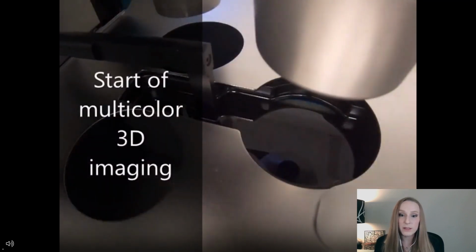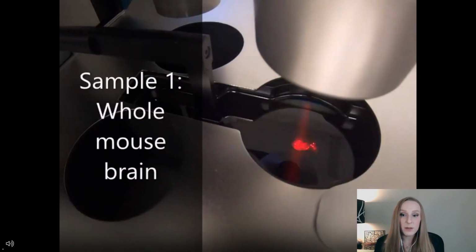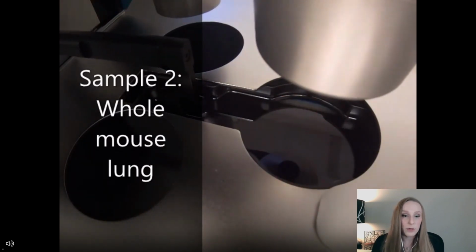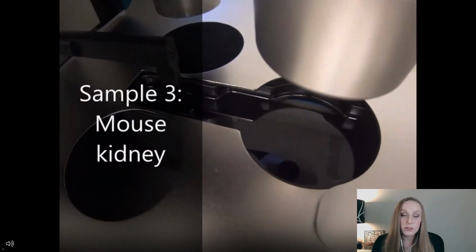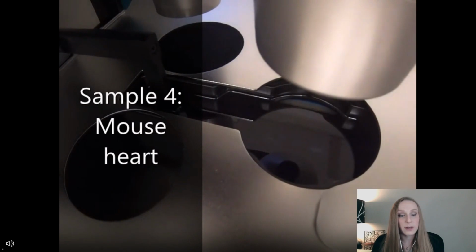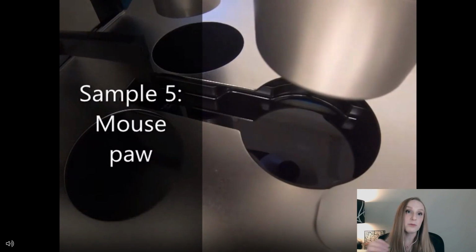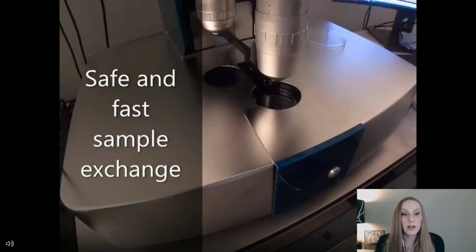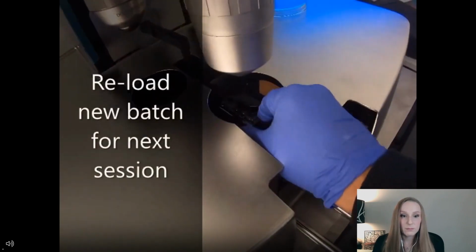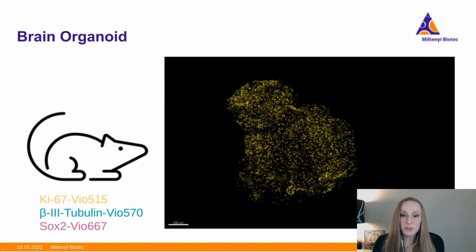So basically we're able to simply release and then mount samples into the imaging chamber like you saw at the beginning of the movie. So this could be a whole mouse or a series of organs. And now what you see is that once you've loaded it in, you've got this batch acquisition that can be set up to automate the acquisition, as you're seeing us go through each of these different mouse organisms or organs. So again, you're able to set all this up ahead of time, get these images done, and then in the end, just take that data off.